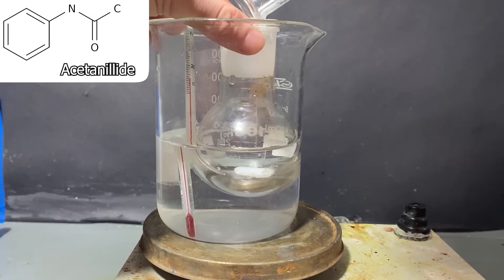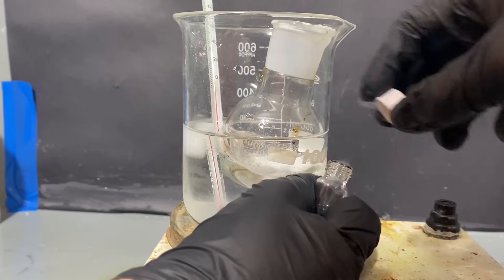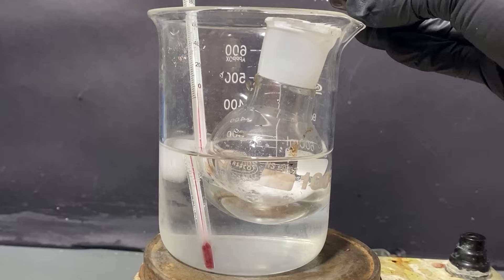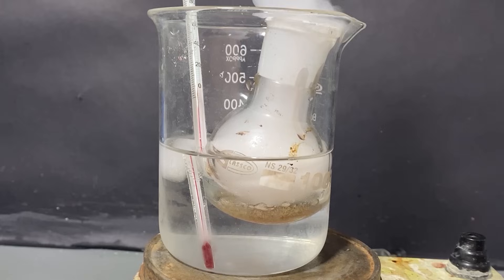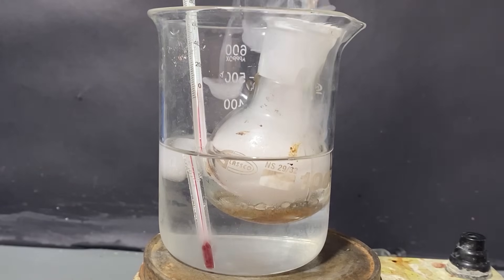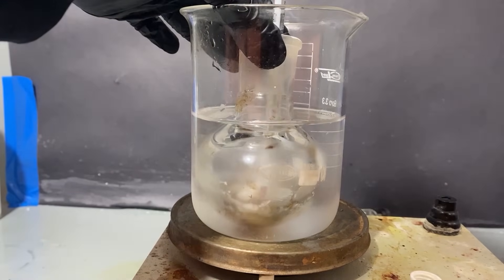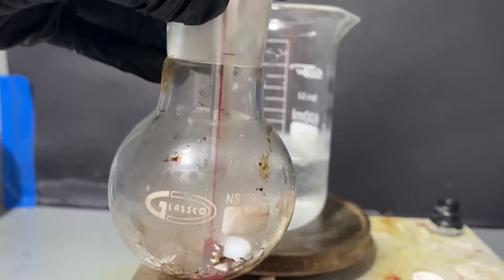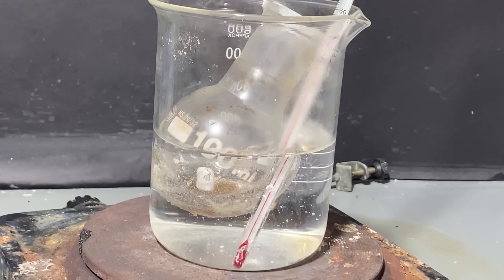To a round-bottom flask, which was stuffed in an ice bath, I added some acetanilide, which I bought online. Then I added all the chlorosulfonic acid into it. Initially, an exothermic reaction can be observed. However, after a while all of that subsides, and the mixture has to be stirred. Eventually, the whole thing turns into this oily goop, which makes it impossible to stir with a stir bar. Next, to complete the reaction, we'll be heating the whole thing at around 80°C.